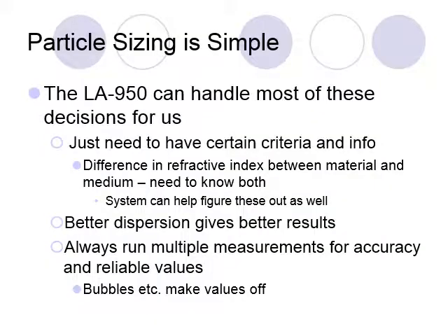I was just discussing how they've improved the instrument to apply to different regimes by using the different light sources. The cool thing about the LA950 is that based on the information that you give it and everything else like that, it actually knows how to best measure what you have. So in terms of how it operates itself, you don't need to worry so much about that.